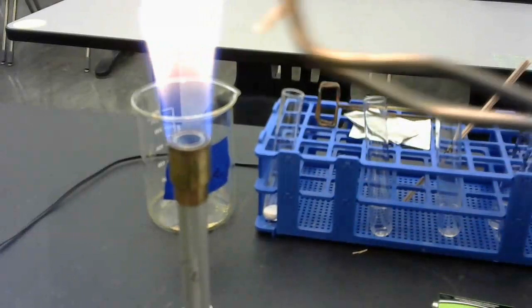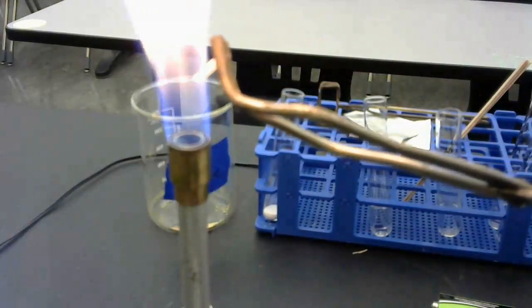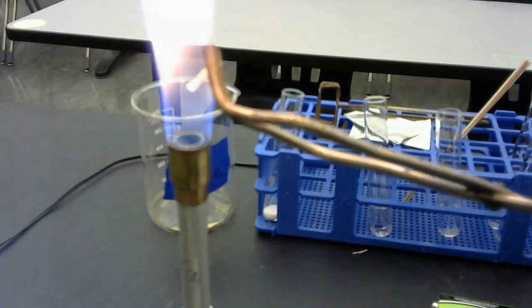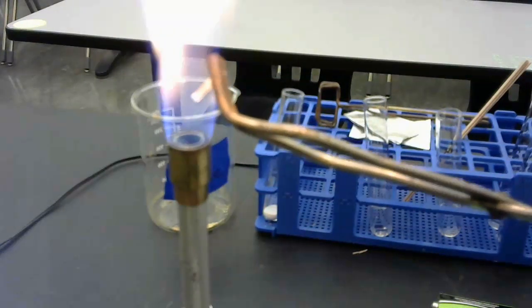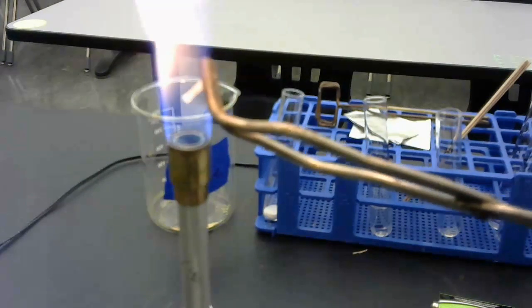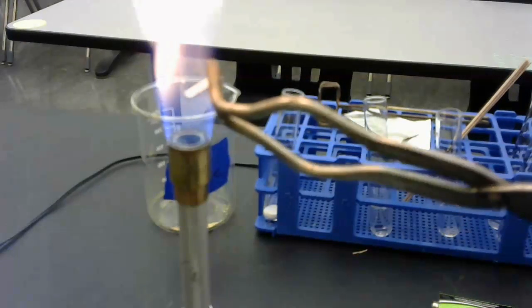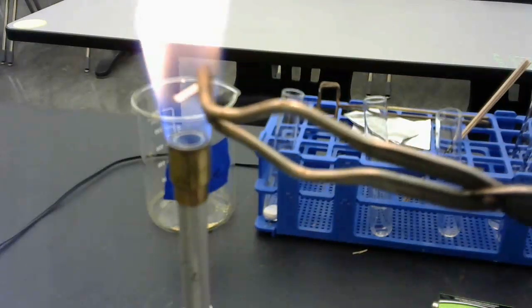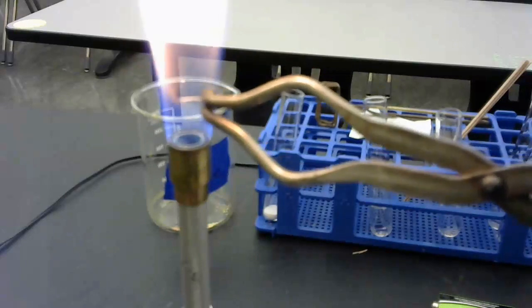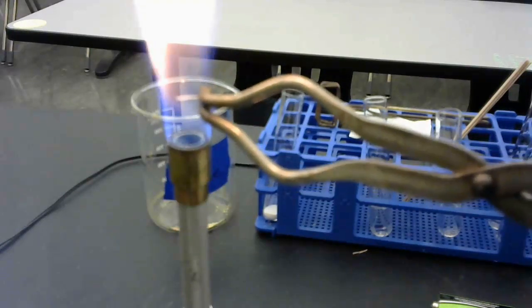When you're doing this in class, make sure that you're not looking directly at that flame while you're doing it, okay? You're going to make observations, so make them from the side. You want to make sure that you have the magnesium in the blue part of the flame. It might take a moment to get going.